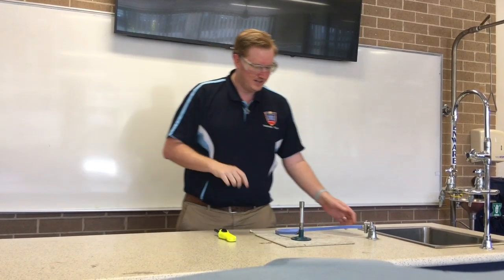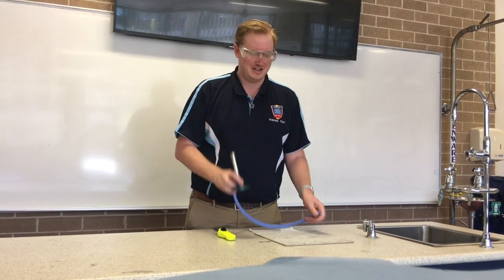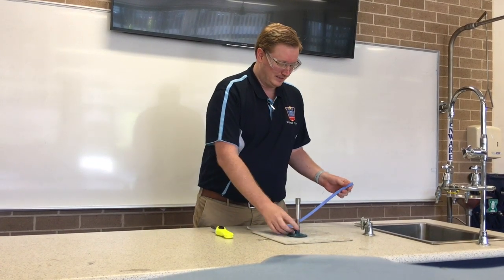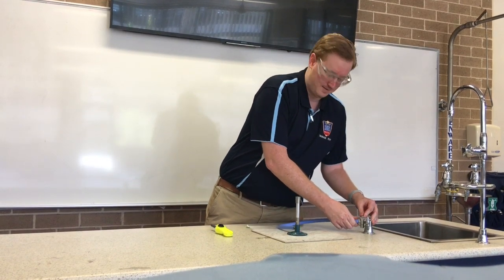So once we've dealt with safety, we have our Bunsen burner and we have our heat mat. The Bunsen burner is going to stay on the heat mat — place it on there — then take the hose and push it over the end of the gas tap.